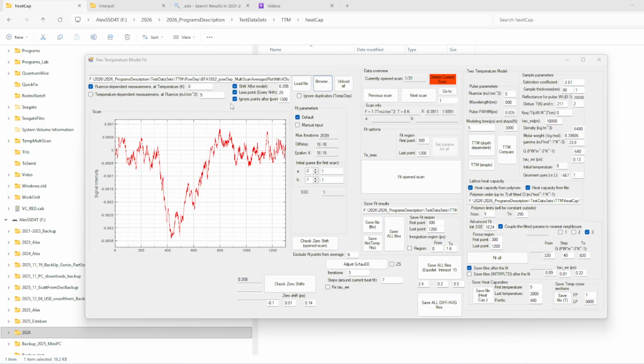Then I will include other videos, two videos probably, one separately on the first steps of fit, and a second video about the main process, the main routine. So in this video, firstly, the window.